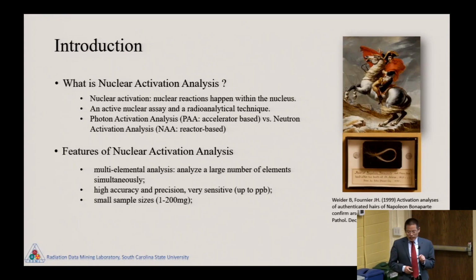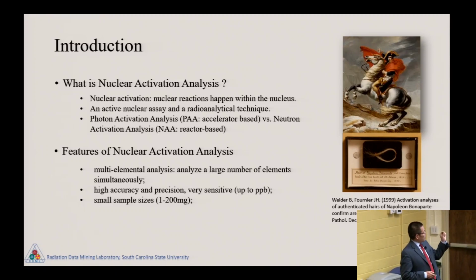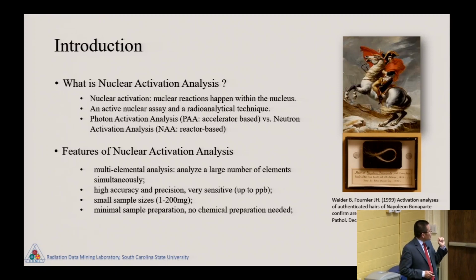And the sample size is very small, we only need 1 to 200 milligrams. And minimum sample preparation, no chemical separation needed. Sometimes when you're doing chemical separation, you actually introduce some contamination. So that's the advantage of it.